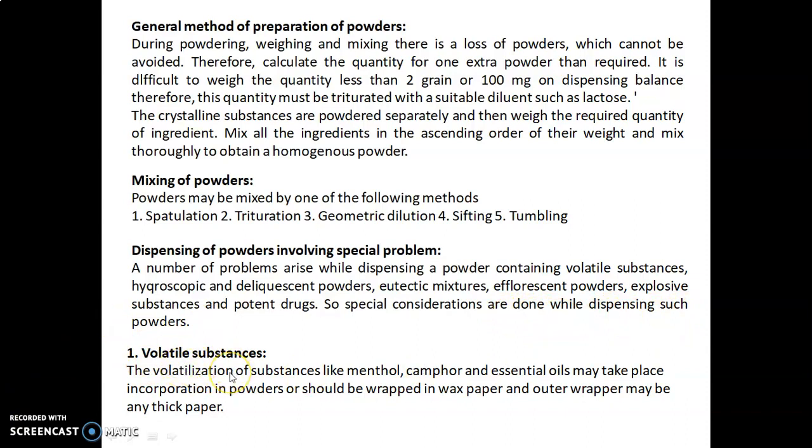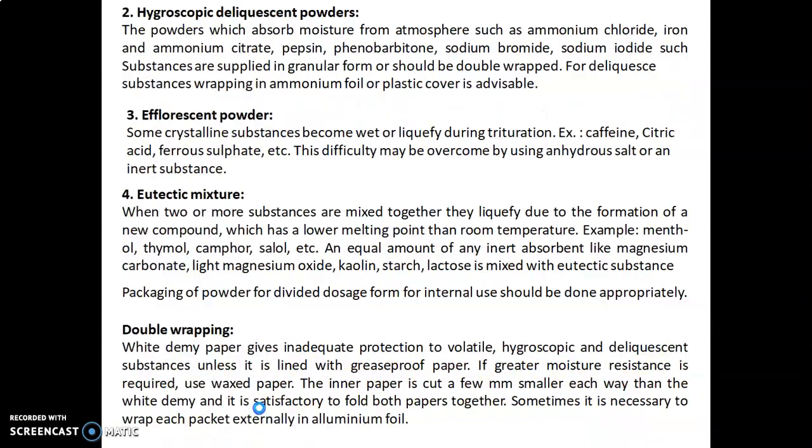Volatile substances. The first problem is for the volatile substances. The volatilization of substances like menthol, camphor and the essential oils may take place. Incorporate them in the powders, or they should be wrapped in wax paper and the outer wrapper may be any thick paper.